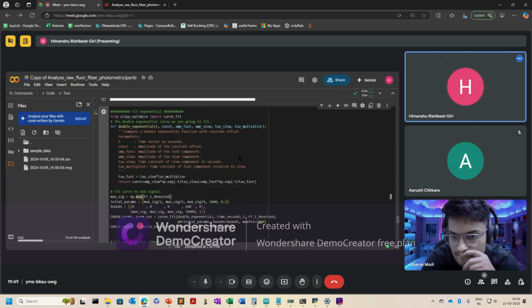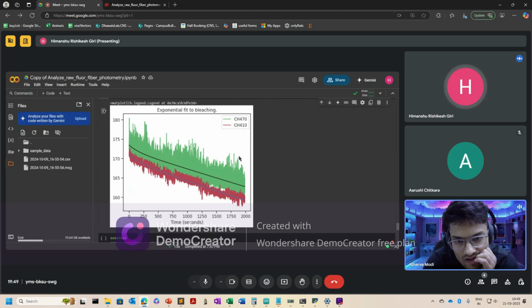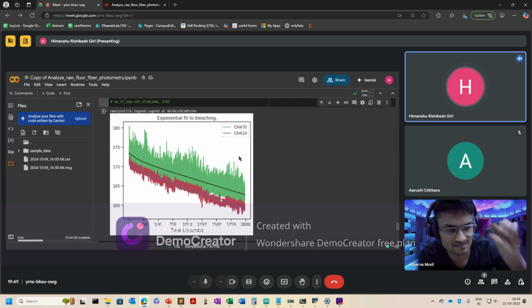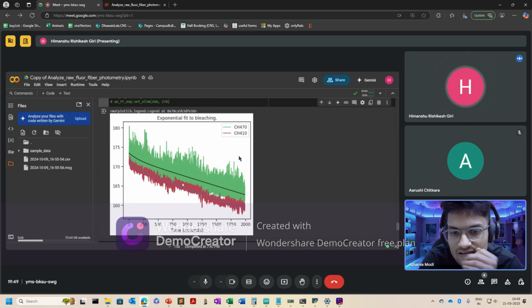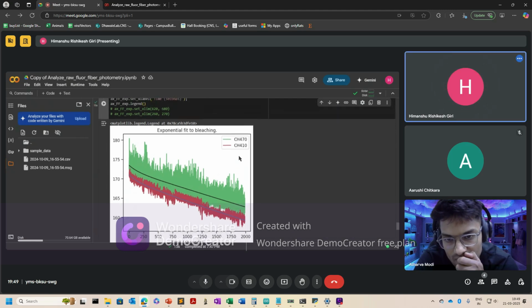Sometimes this step is very odd. In the fit, in the middle, like in the red part, there is a step-kind of change. This one does not fit very well, and it may exist in the green too, though not very visible. These kinds of errors occur, and sometimes to such a great extent that you have to analyze the chunks separately.